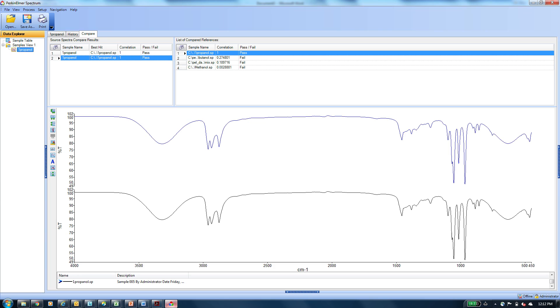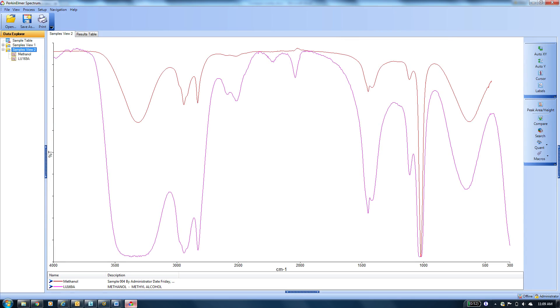Now let's talk about something where we're faced with the analysis of a known compound. Here, we typically just want to verify its identity and quality by matching to a reference spectrum of that known compound. With the compare software, we will automatically analyze a sample spectrum against a reference spectrum to produce a compare result, which will allow us to either accept or reject the spectrum based on quality control limits.